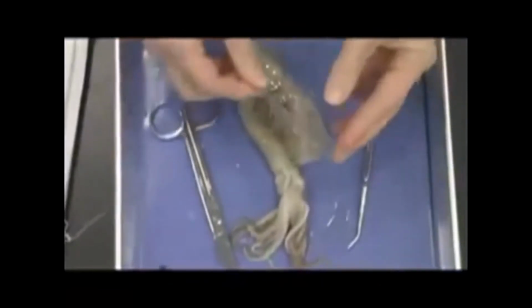And fun fact, in ancient days, this was actually used as a pen. The people would dry it and then use the ink from the squid itself to use it as a pen. And that's about it.